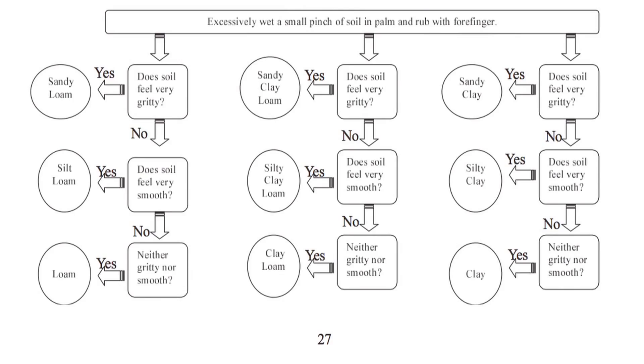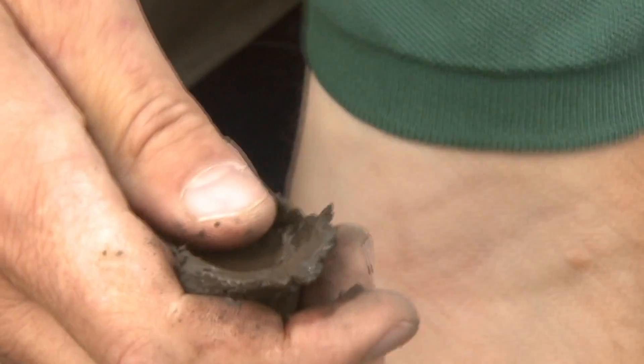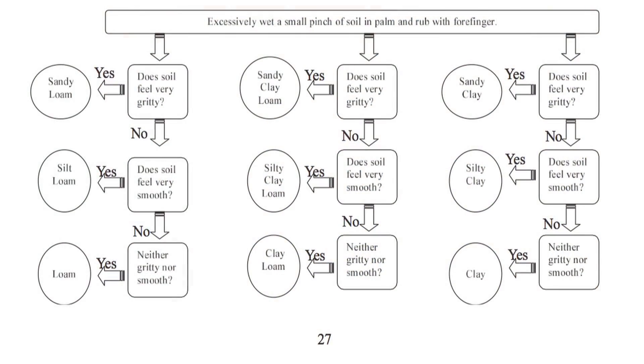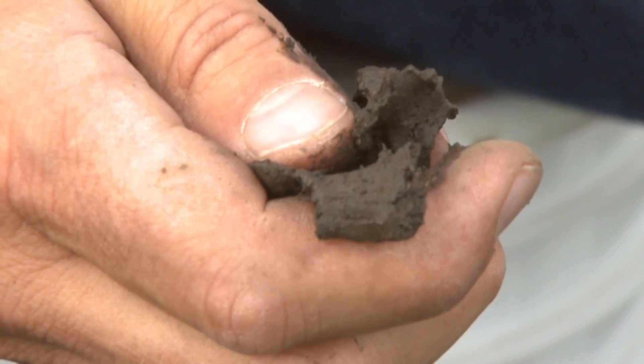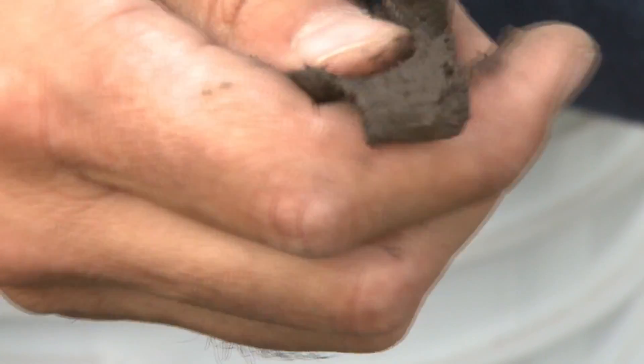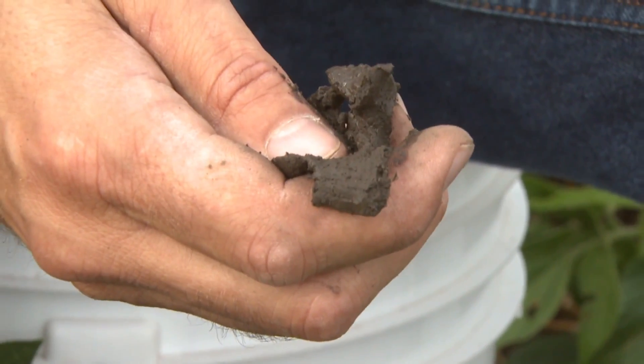We make the soil really wet like this so we can feel what it's like. The question is: does the soil feel gritty, or does it feel very smooth, or is it neither gritty nor smooth? That will indicate sandy loam, silt loam, or loam respectively. In this case it does feel gritty, so it's going to be a sandy loam texture. If it felt smooth it would be a silt loam; if neither gritty nor smooth, it would be a loam.